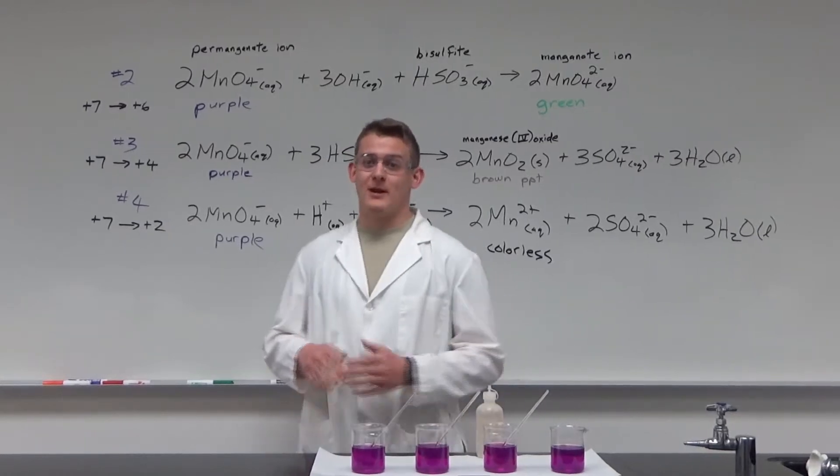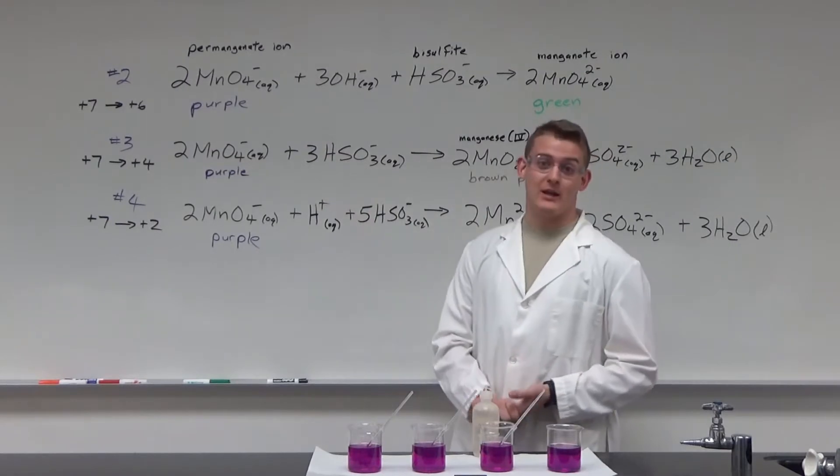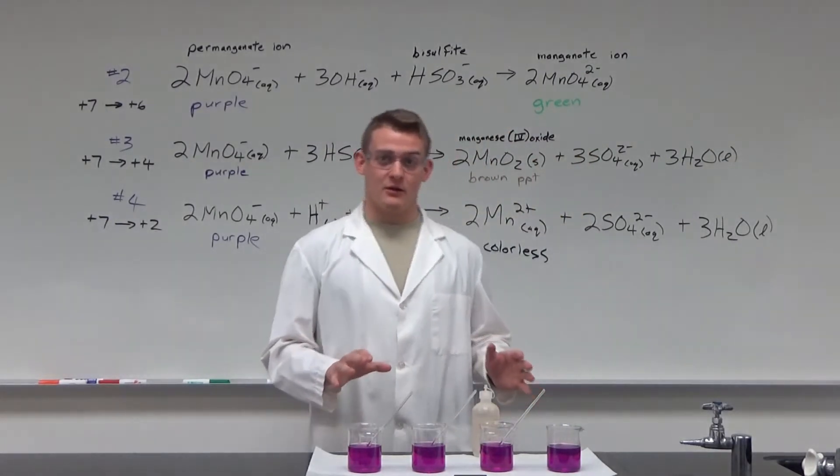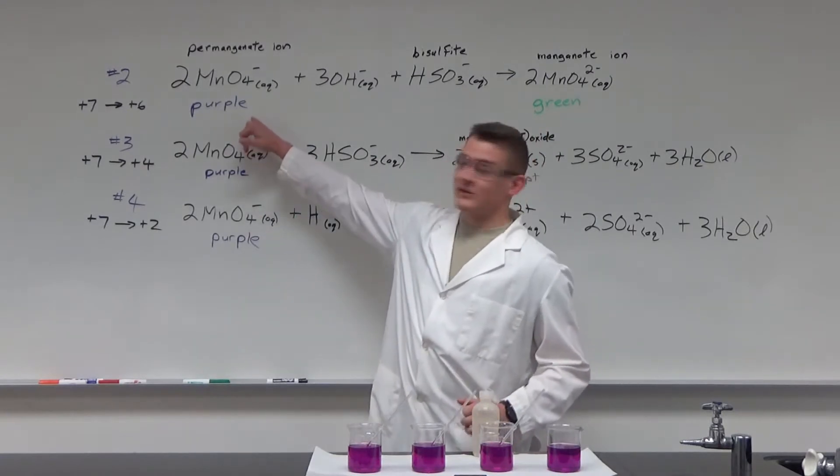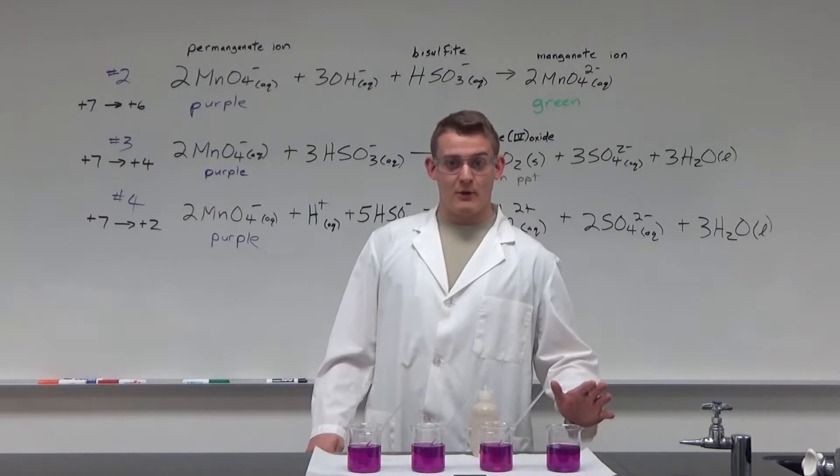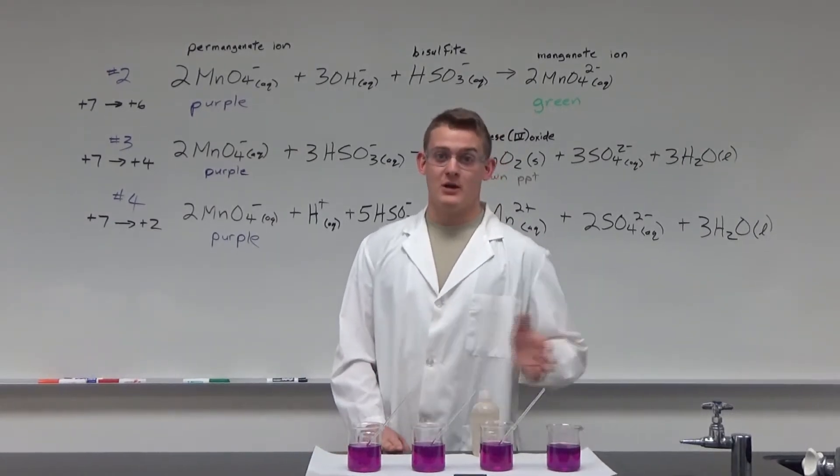How's it going? So today we're going to be talking about manipulating the oxidation states of the permanganate ion. In front of me, I have four different beakers that have purple solution of the permanganate ion. This first beaker we're not going to do anything with, it's just going to be the reference beaker so that we can compare it to the rest of them.